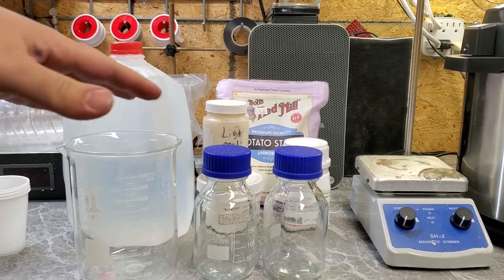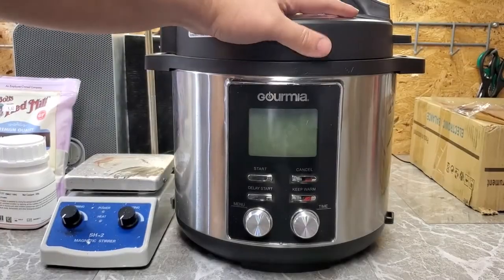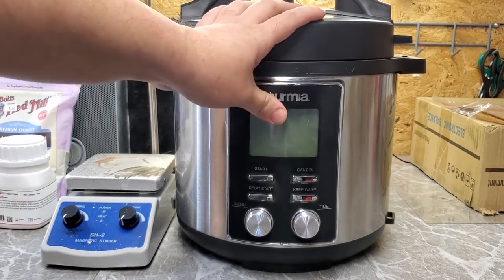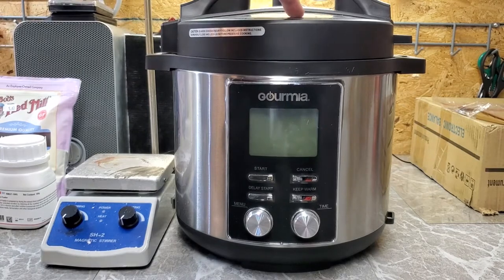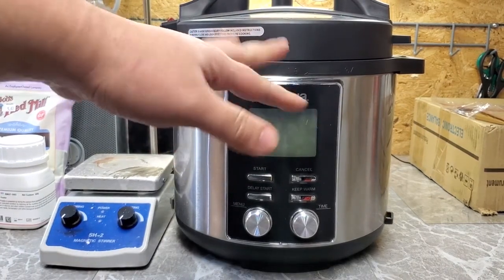I did make a video on how to make petri dishes about two years ago. In this video, instead of using the boil-the-crap-out-of-it method to sterilize the agar, I'm just going to be using an instant pot. These are very handy to have — I highly recommend getting one if you can find one cheap.